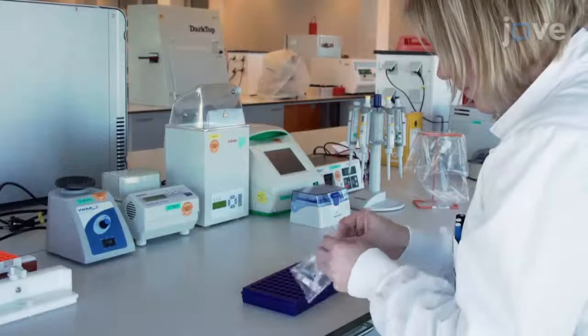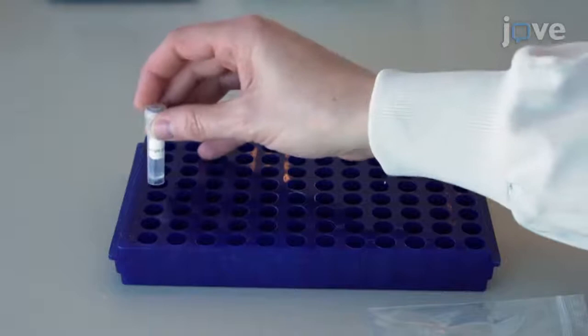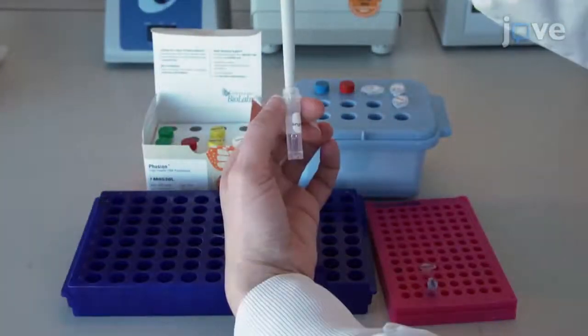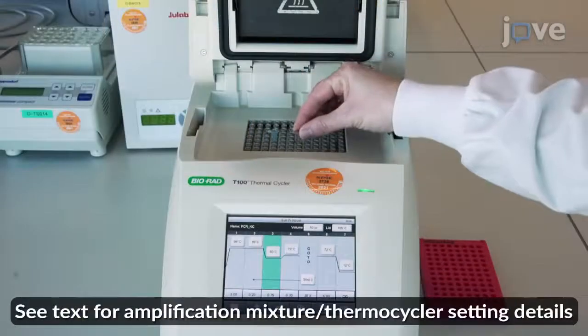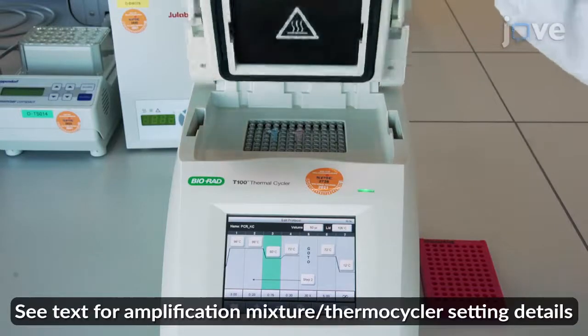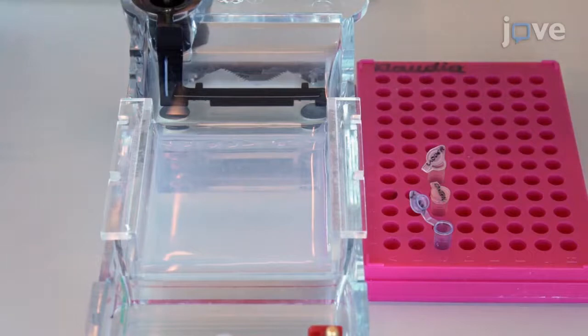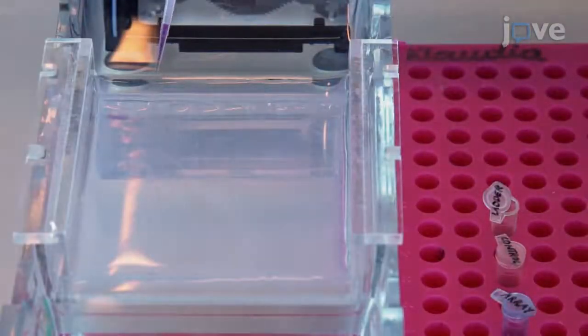After obtaining a single crRNA array for multiplex genome editing experiments as synthetic DNA, prepare the PCR amplification mix and load the array into the thermocycler for amplification. To analyze the PCR products by electrophoresis, run the samples on a 0.8% agarose gel at 5 volts per centimeter for 40 minutes, with a DNA ladder with DNA fragments ranging from 100 to 10,000 base pairs.